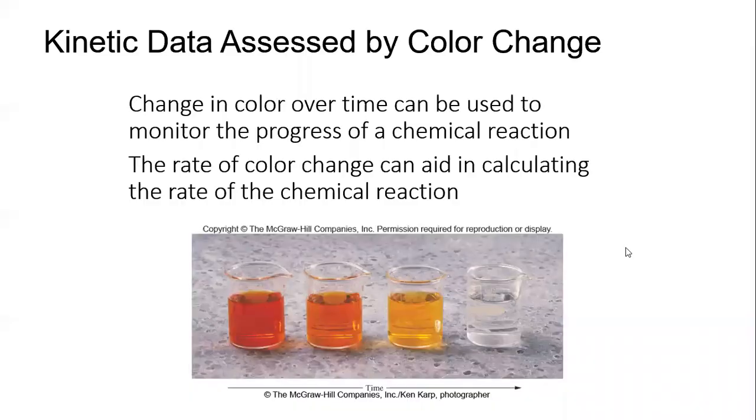So now you're going to start with a colorless solution. You're going to time how long it takes to turn a bluish, or I would say maybe violet color solution. So we're going to be timing how long it takes the reaction to produce that complex.